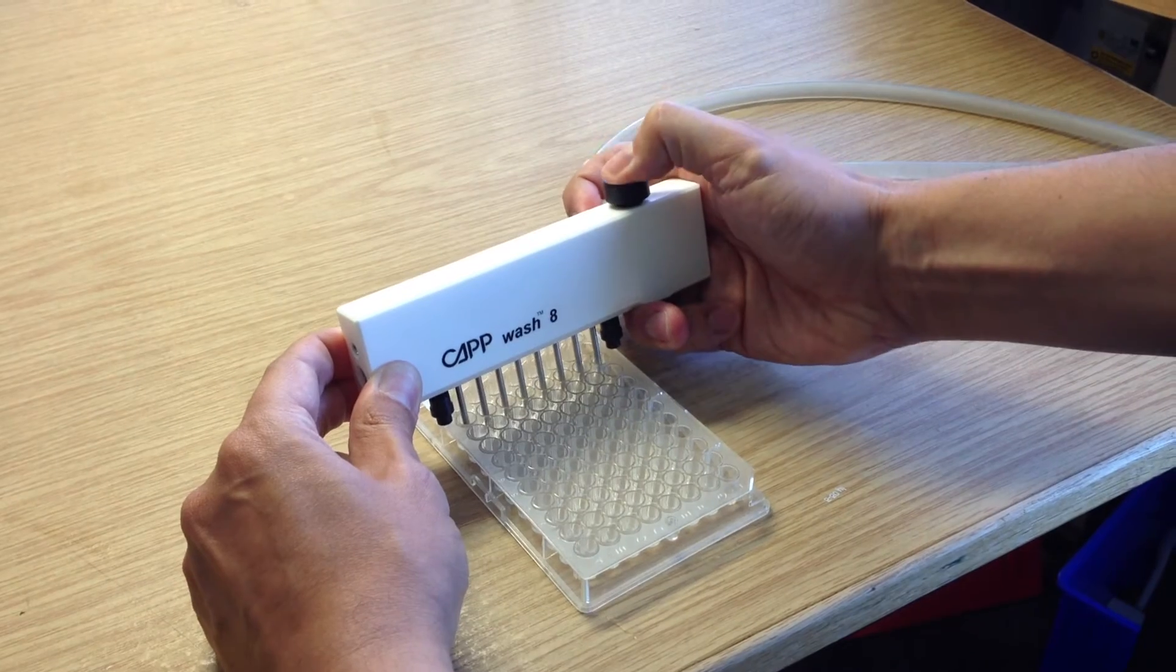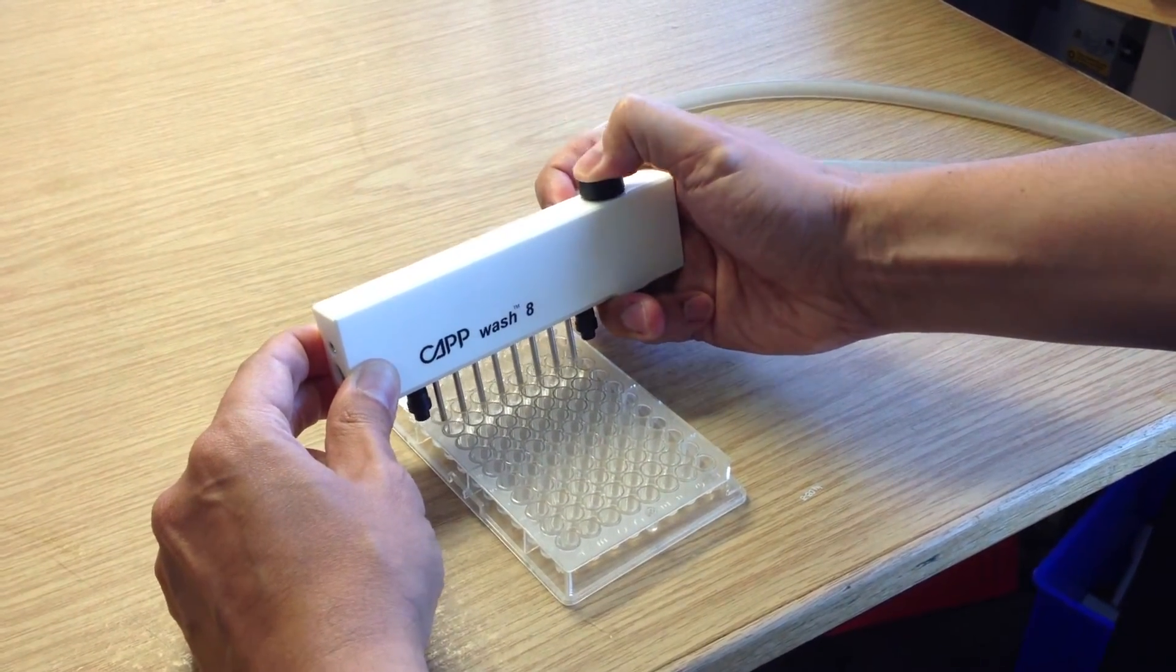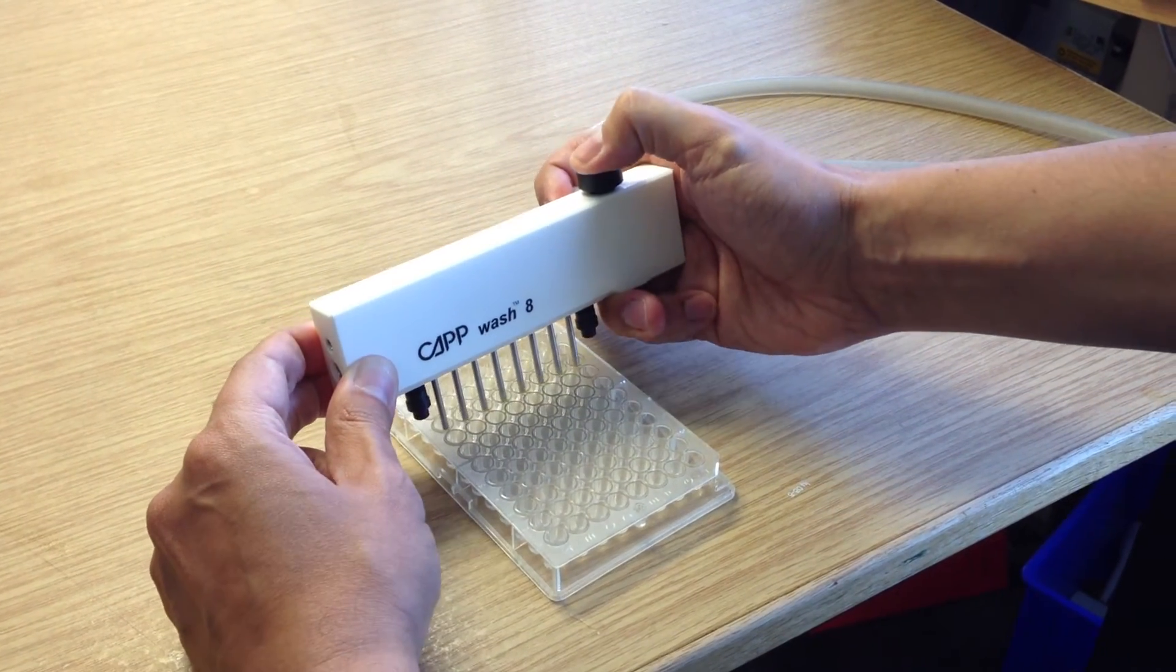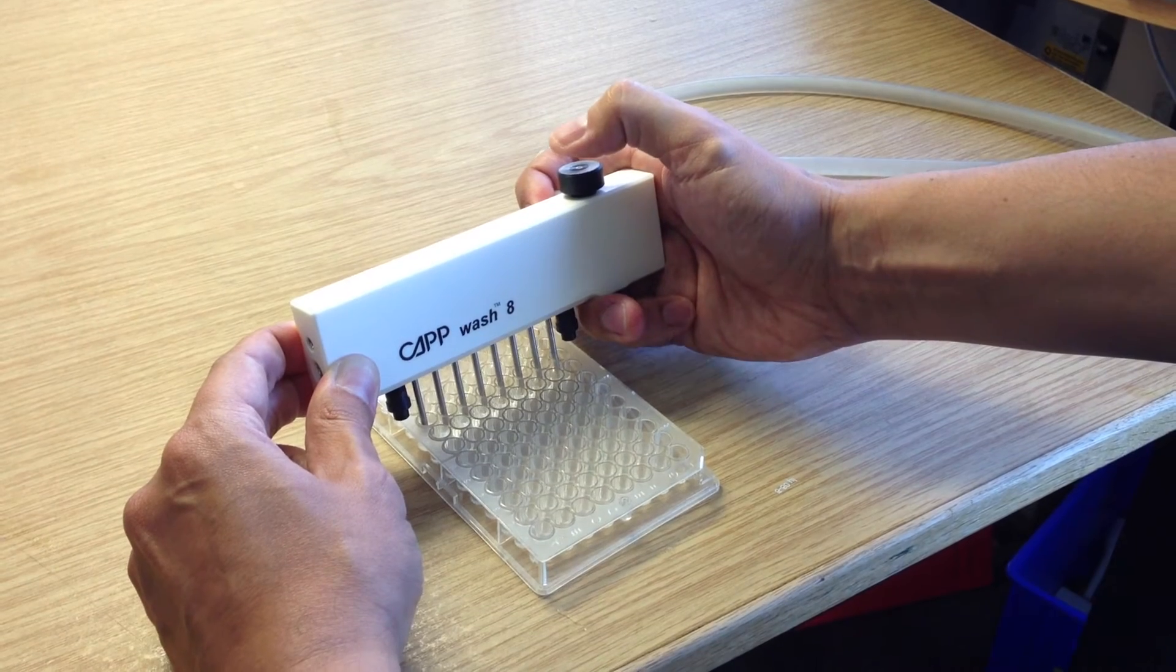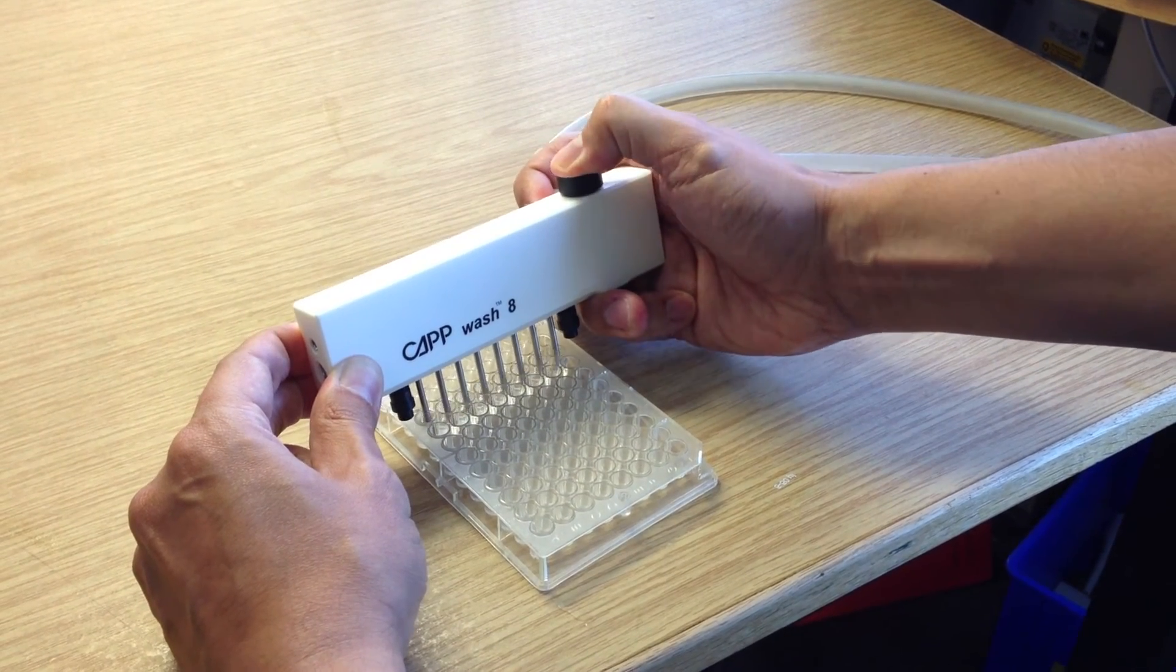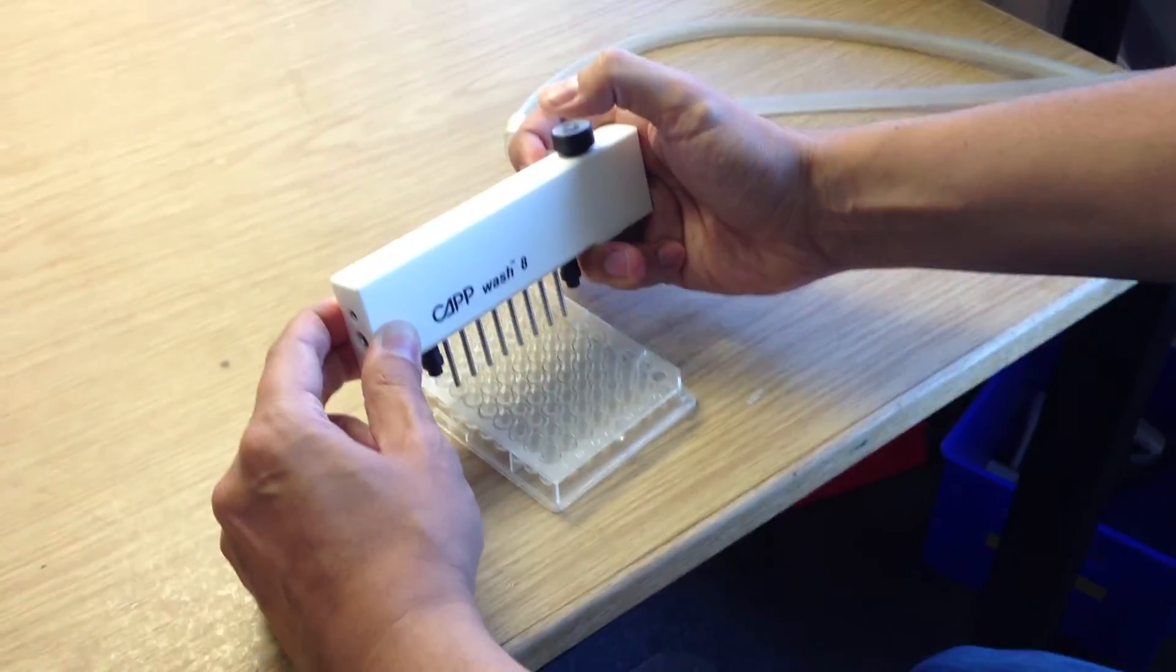So it's a manual system but very reliable because you can control exactly what you're doing. And the two-in-one system allows very low risk of clogging due to crystallization of the reagents.